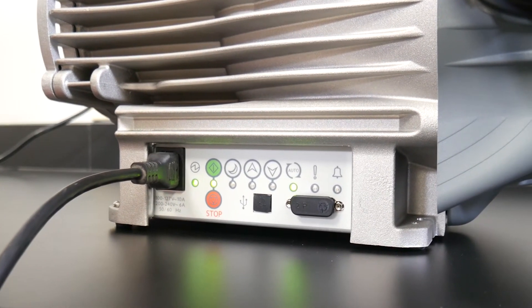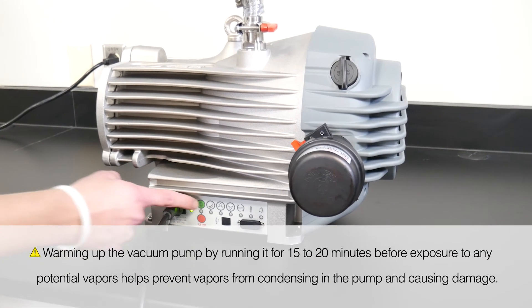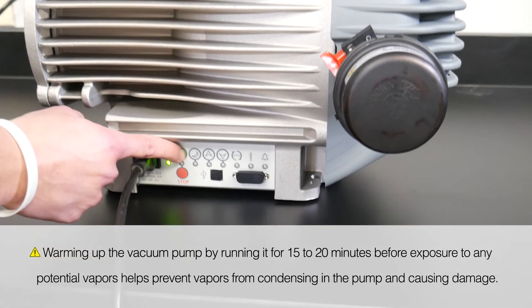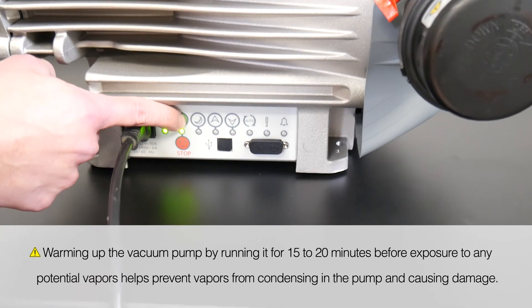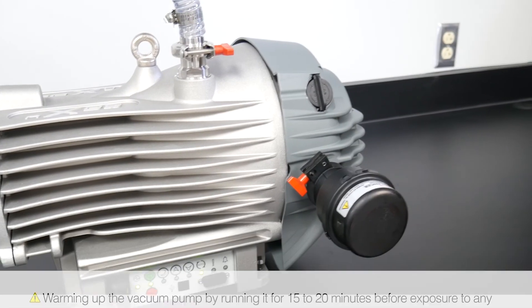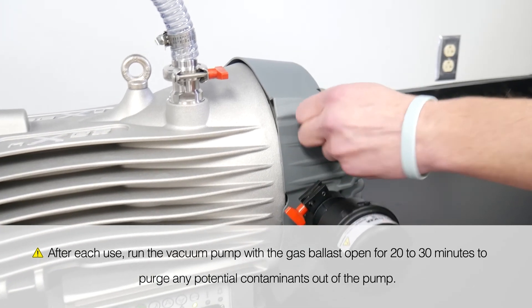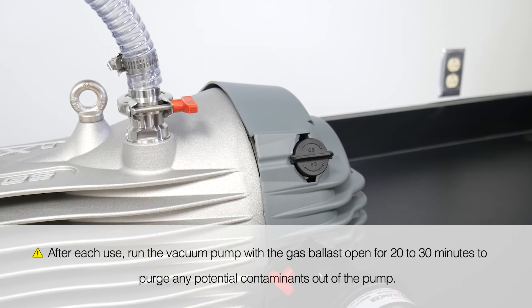Here are a few tips to ensure the longevity of your new vacuum pump. Warming up the vacuum pump by running it for 15 to 20 minutes before exposure to any potential vapors helps prevent vapors from condensing in the pump and causing damage. After each use, run the vacuum pump with the gas ballast open for 20 to 30 minutes to purge any potential contaminants out of the pump.